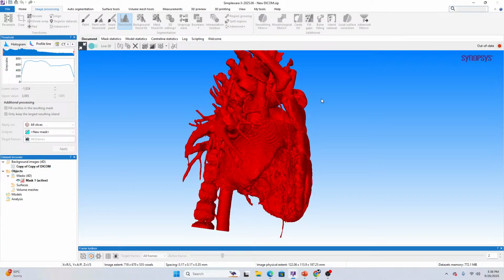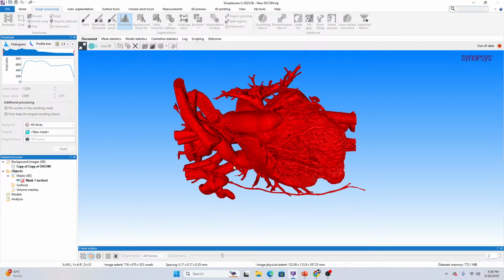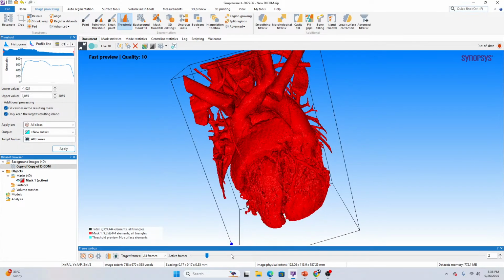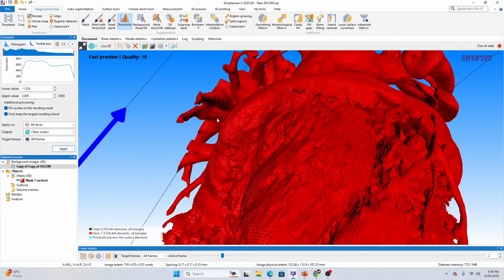The GPU is causing some issue for the dataset to be loaded. So it's taking some time. What I can do instead is show, corresponding to each and every time frame, how the segmented output would look. For example, if we need to check for the systolic phase or diastolic phase, the time frame can be selected accordingly, and we can further move out this result.